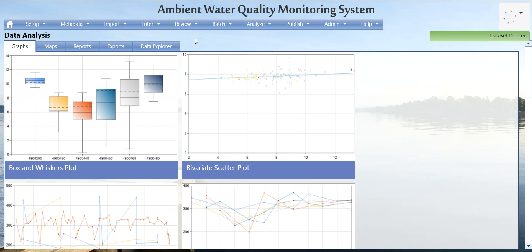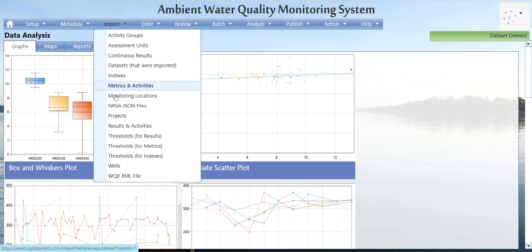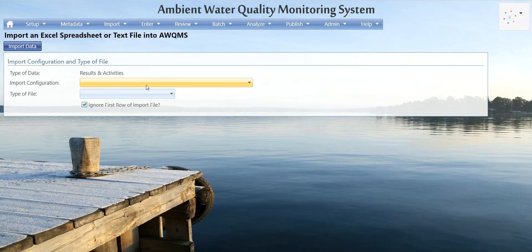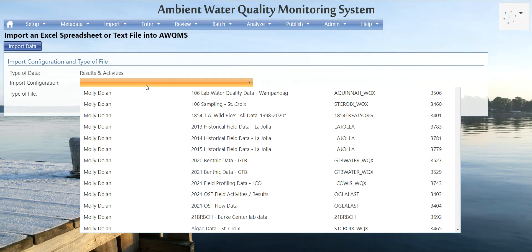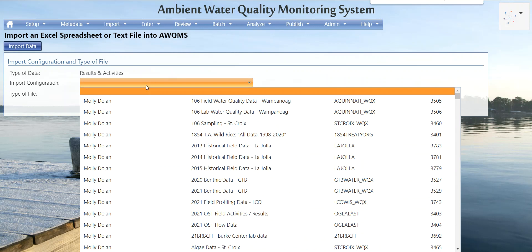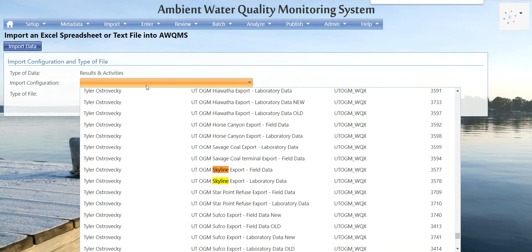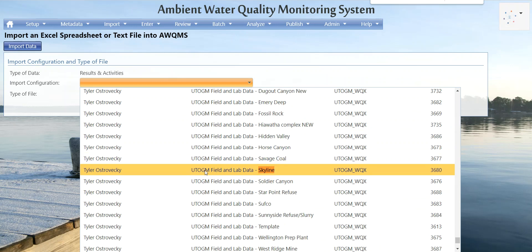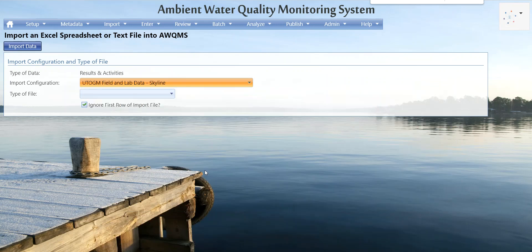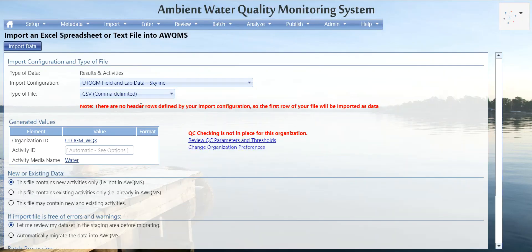I will be using the import configuration built for the Skyline Mine as an example, but know that if you're importing data for a different mine, the order of operations will be exactly the same — you'll just choose a different import configuration. I'm going to hover over Import and click Results and Activities, then choose my import configuration by clicking the drop-down. Here it is: UT OGM Field and Lab Data - Skyline.